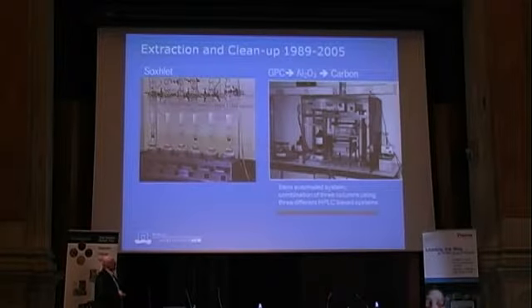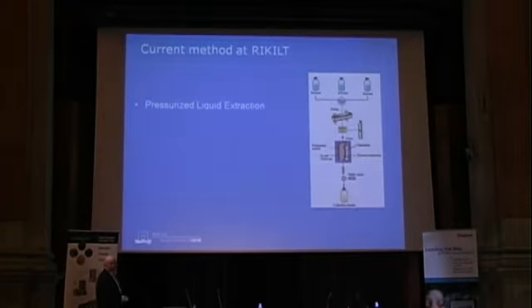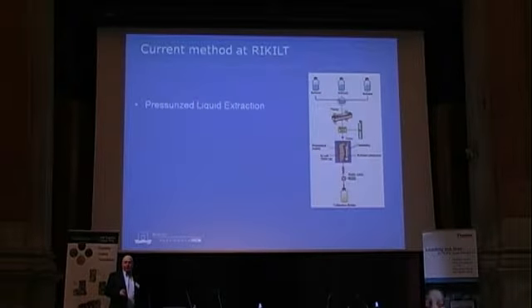Nowadays, if you have, let's say, a sample of animal feed or a soil sample or a fish sample, we go to the PLE, the pressurized liquid extraction. And actually, I explain it too, we have a lot of visitors, a lot of policy makers in our institute, and I explain to them, this kind of device, it's an expensive espresso machine.